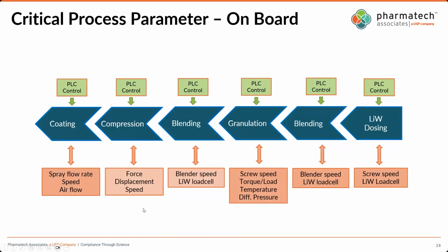Yeah. And what is, to my taste, also forgotten a lot, and this is why I bring this slide up, is that there are already a lot of sensors on board of each of these systems, where you measure the force of tablet by tablet anyway. So you have 100% testing, kind of an indirect testing. So it makes sense to say whatever you implement inline should be capable of supporting these. But I think there's another way of looking at that.